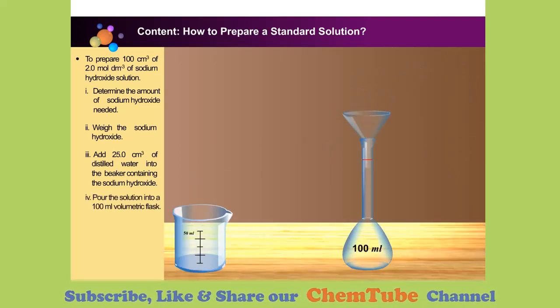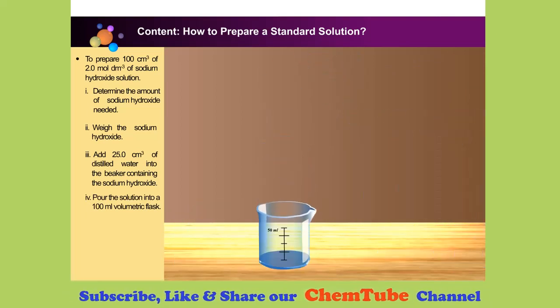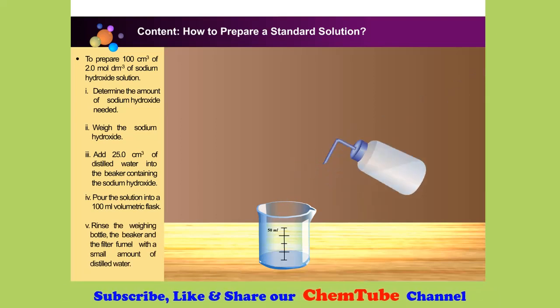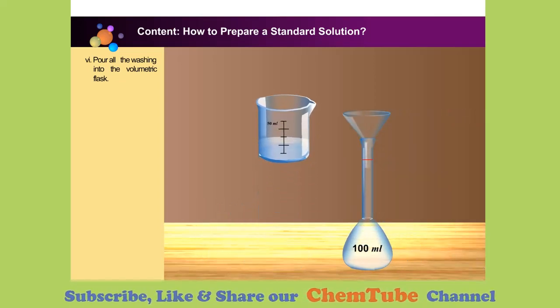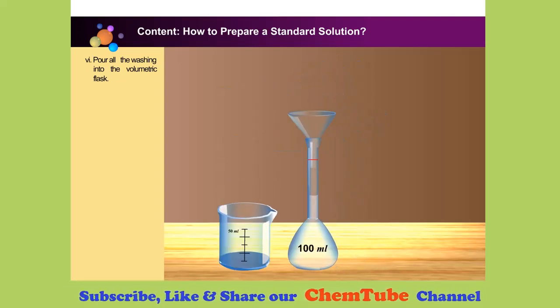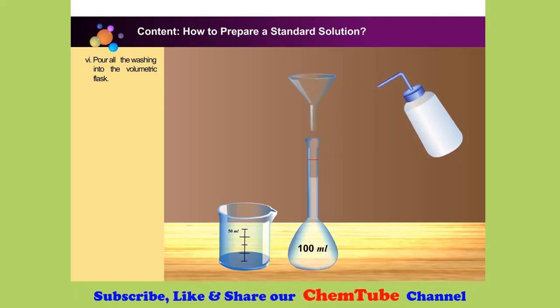Pour the solution from the beaker into a 100 cubic centimetre volumetric flask through a filter funnel. Rinse the weighing bottle and the beaker with a small amount of distilled water and pour all the washings into the volumetric flask. Repeat this a few times. Rinse the filter funnel with a small amount of distilled water and allow the washings to flow into the volumetric flask. Remove the filter funnel from the volumetric flask.